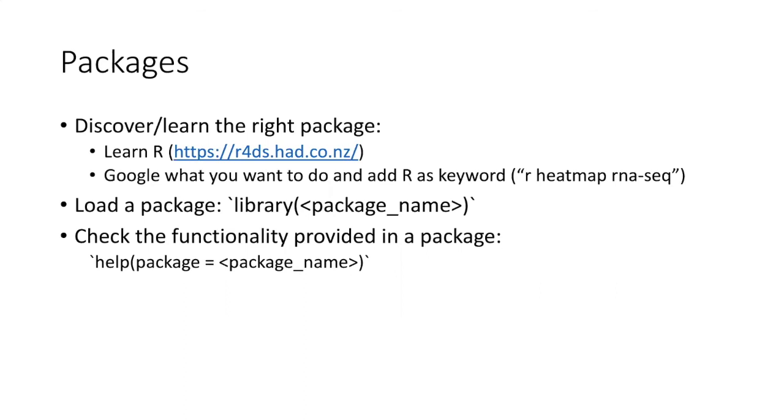First of all, just be aware, when you log into the teaching cluster, R is not available in your base path. You need to module load a specific version of R, okay? There's lots of different flavors: 3.1, 3.2, 3.6. There's 3.6 and 4.0 on the teaching cluster. Stick with whichever version you use, because the packages that you load are specific to that version of R, all right? So just be aware.